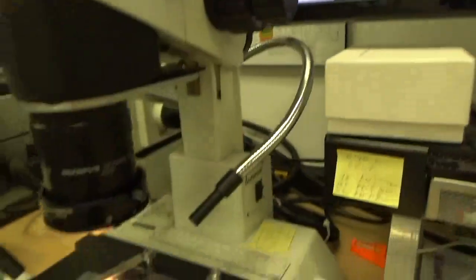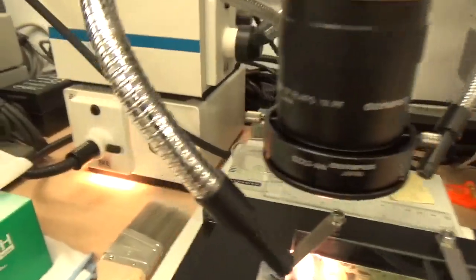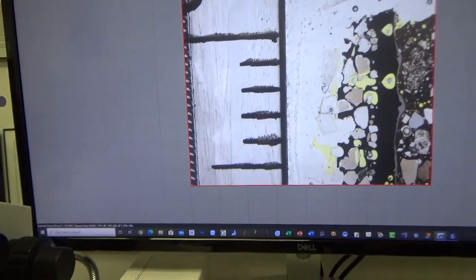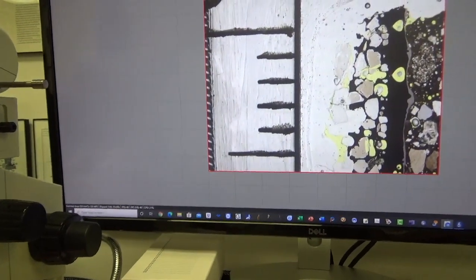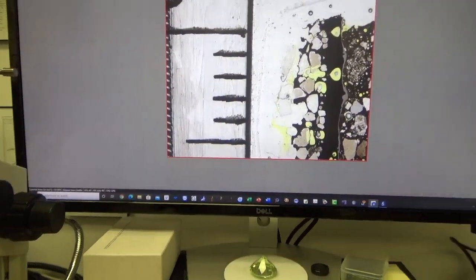There are a couple of things to remember. Number one, you don't change the brightness of your light. It stays at the maximum value where you set your preset. Number two, when you scan, make sure you have about 20% overlap between two rows of scan. You do the first row, then 20% overlap. It's very important you have 20% overlap between two successive rows of scan.